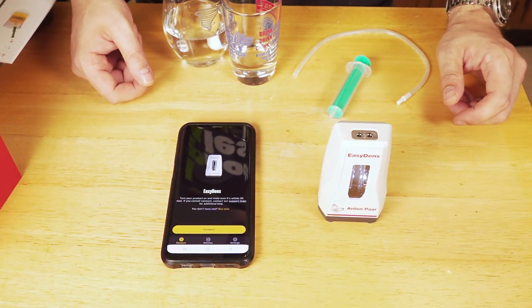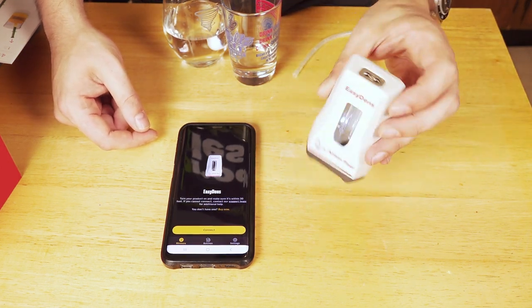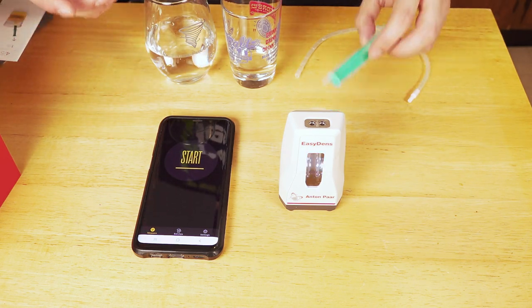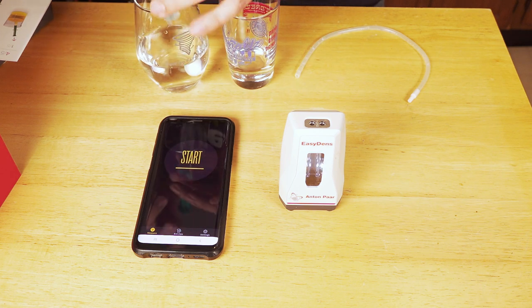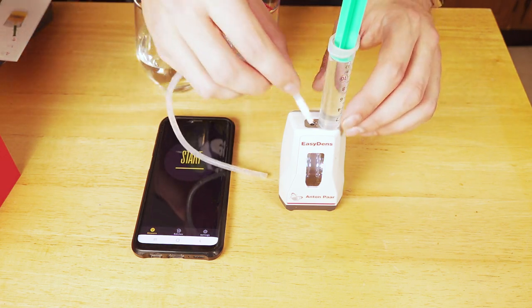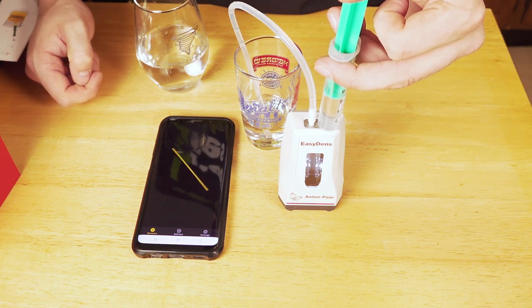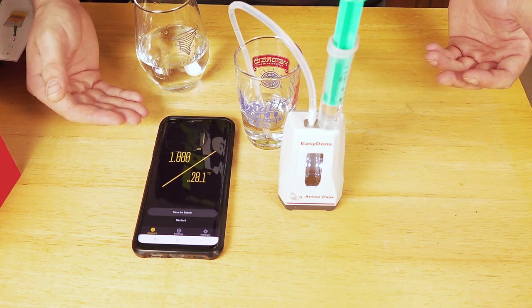To start, you've got to get the smartphone app downloaded first. Once you do, you'll be presented with this screen here. Make sure that the EasyDance is on — you'll see it flashing — then hit that connect button and it should find it for you. The first thing to do when you get your EasyDance is make sure you know where the calibration point is. Get some distilled water, fill up a small glass, and push it through the EasyDance to take a measurement. It should, if it's properly calibrated, be at 1.000 specific gravity. If it's not, you'll need to refer to the instruction manual for a more detailed calibration procedure, but it's really not all that difficult.